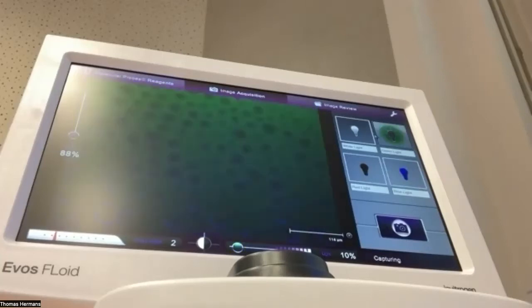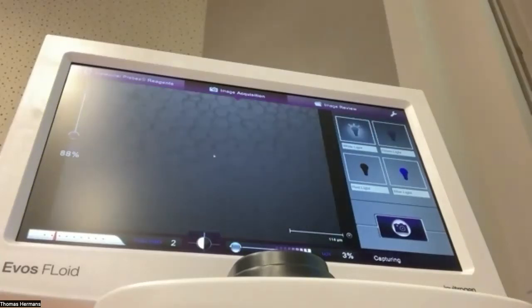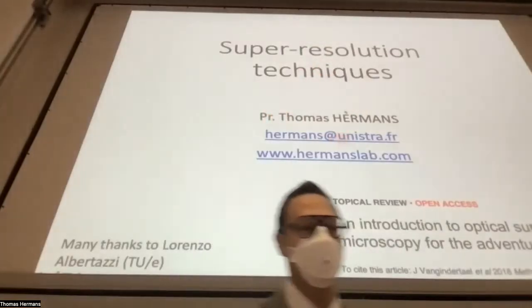But actually, if you put this sample under a microscope that has a spectral detector, so that it can see real colors, it actually has different emissions. But in the break, we'll play a little bit. I brought the same solutions, you know, fluorescein, rhodamine. We can put some drops on a glass slide and then see what it looks like. Okay, this looks okay.